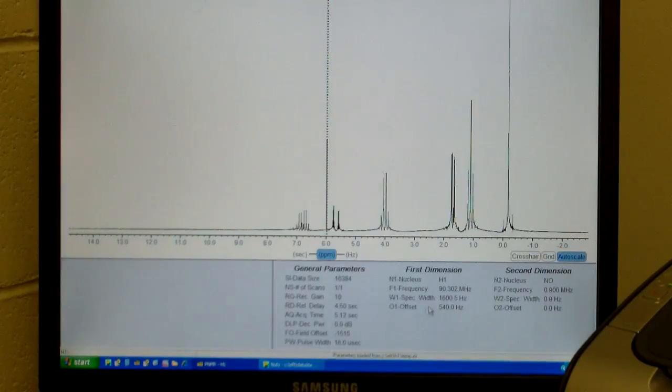there are settings on the NMR spectrometer, some of which you can change, most of which you should not change. But some that you certainly will try to change over the course of your year are the number of scans and the receiver gain. You'll see that there is a 2-letter symbol for each particular control. So let's imagine that we want to change the receiver gain. The receiver gain control is RG, so we'll type RG, enter, and the software will prompt us to tell it what we would like the receiver gain to be. Let's say we want it to be 12, and we'll say OK.